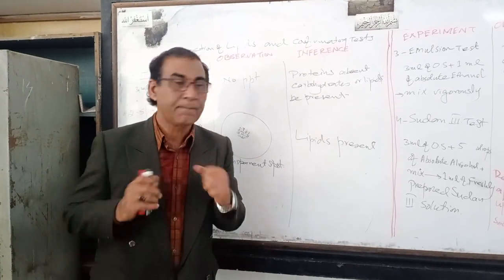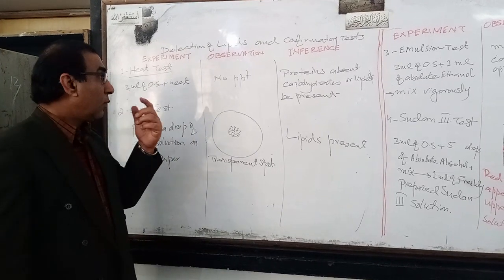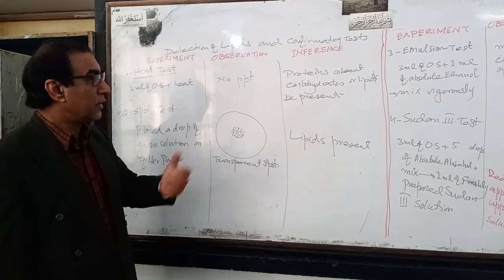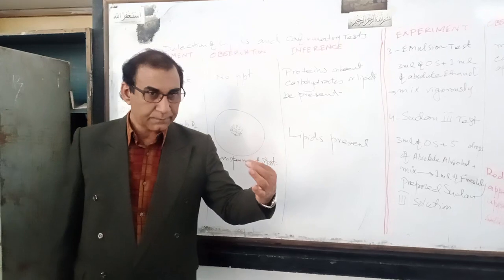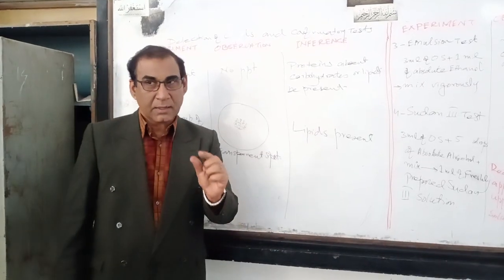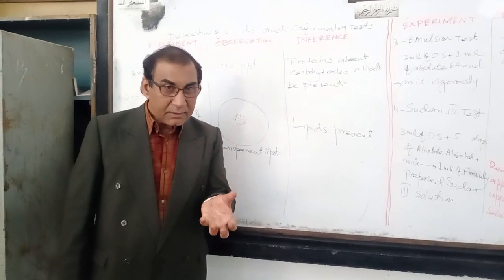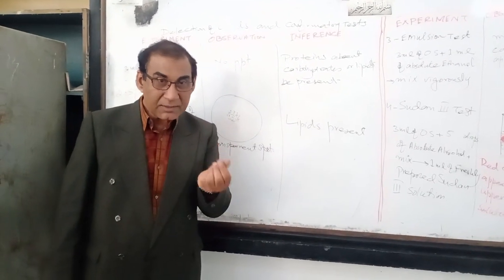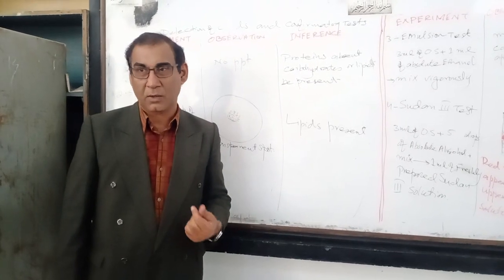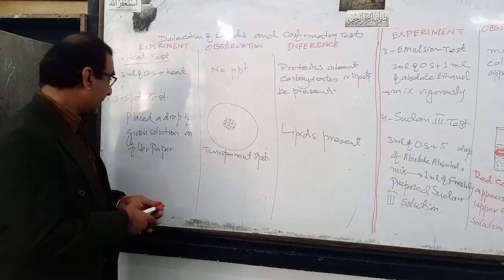One more thing I should tell you: when you perform this test, if there are lipids, then you can detect an oily smell. Okay, oily smell. Next test is the spot test.